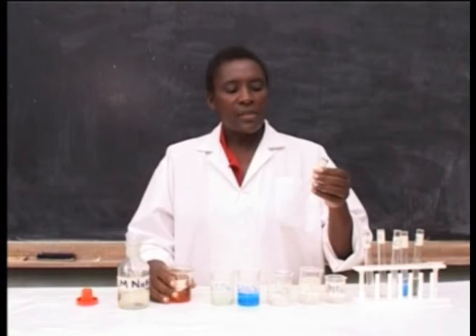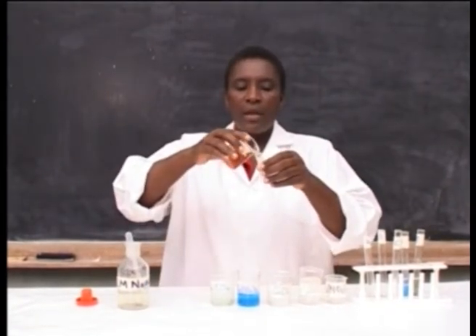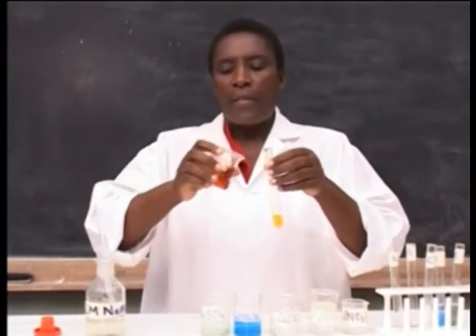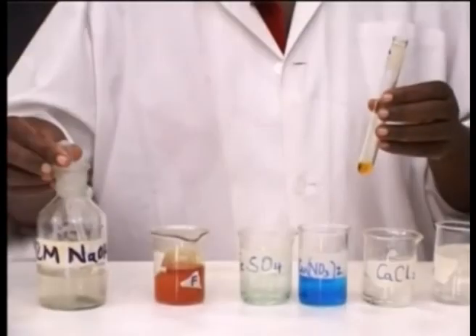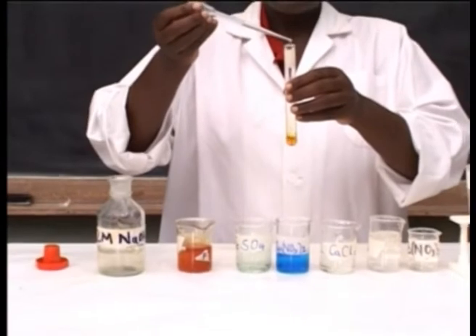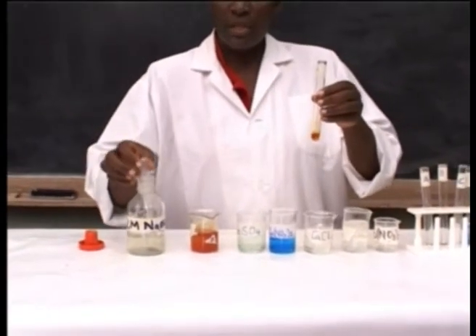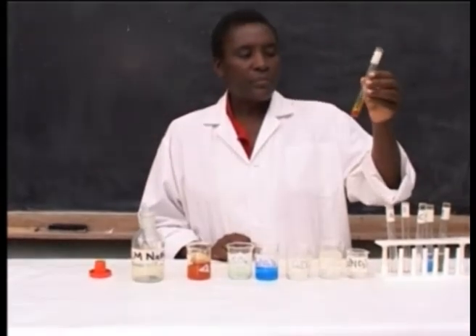In the last test tube F, put iron 3 chloride solution and add sodium hydroxide solution dropwise.